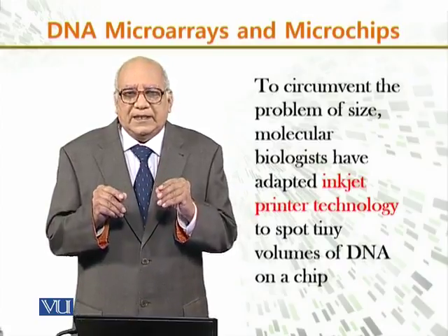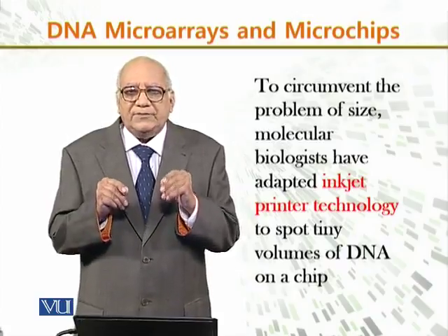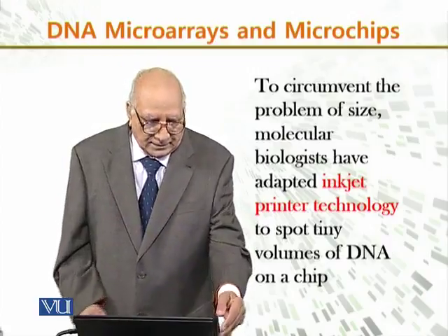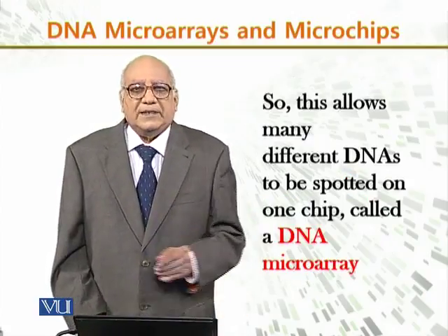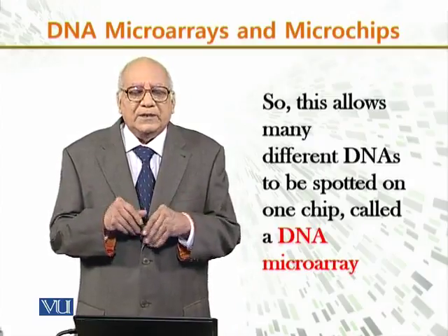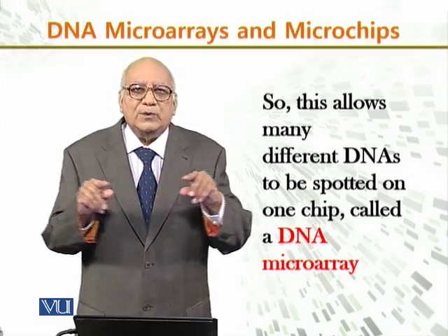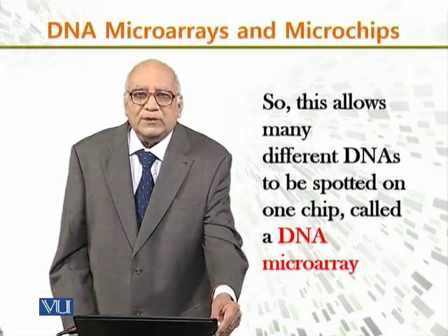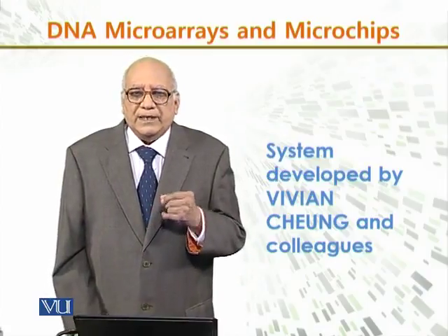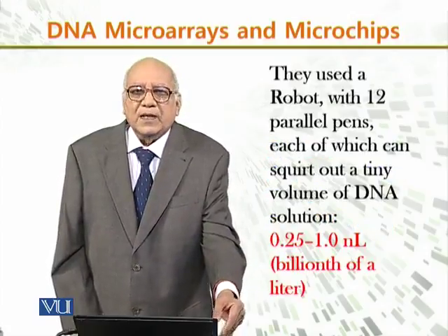Just as an inkjet sprinkles very, very small drops of ink to make a picture, that's the idea they get from. This allows many different DNAs to be spotted on one chip, which is called a DNA microarray. Now, this system was developed by Vivian Xiong and his colleagues.